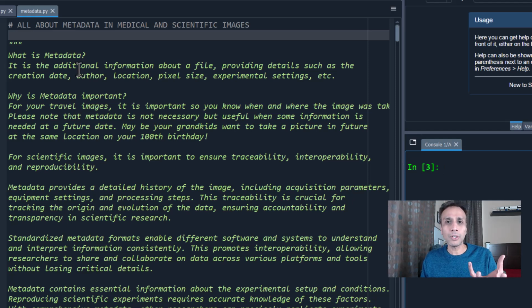And how do you store this data? One thing you can do is have an image and a text file or something else associated with this image and take notes in that text file. But images travel. You share it with someone, but it's very challenging to always associate this additional file with your original image. This is why it's customary to embed all the metadata into your images, which may make your image bulky depending on how much metadata you are after. But in general, that makes it a lot easier for these images to be in a single file. Also, while you update this metadata, if it's written to the same file, you can actually trace how the images have been modified.